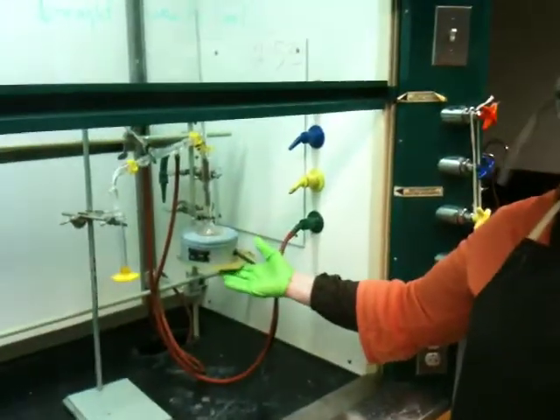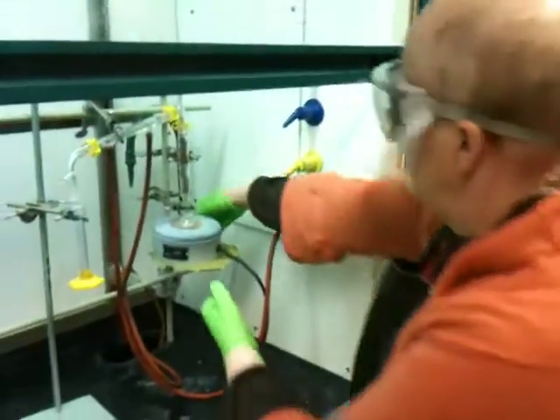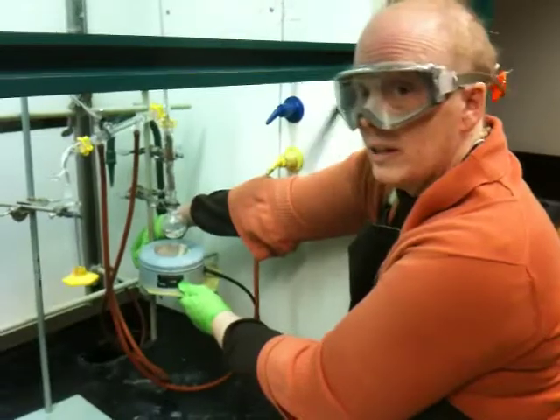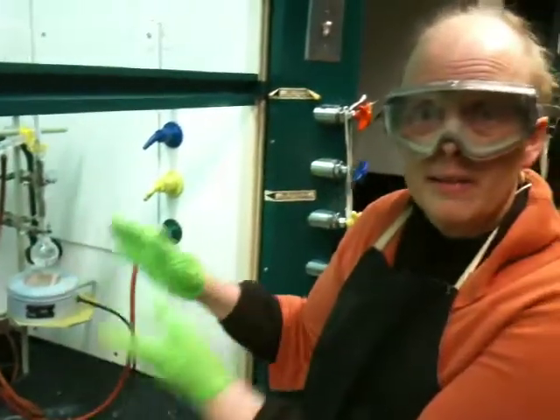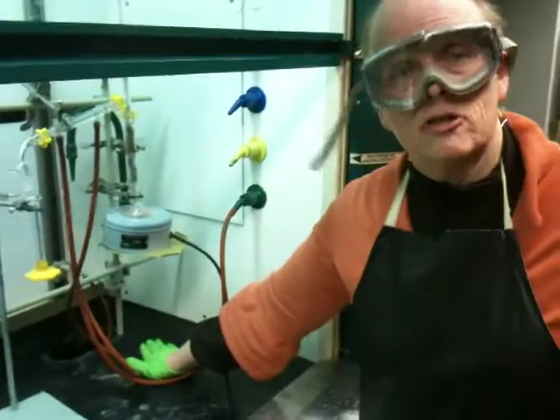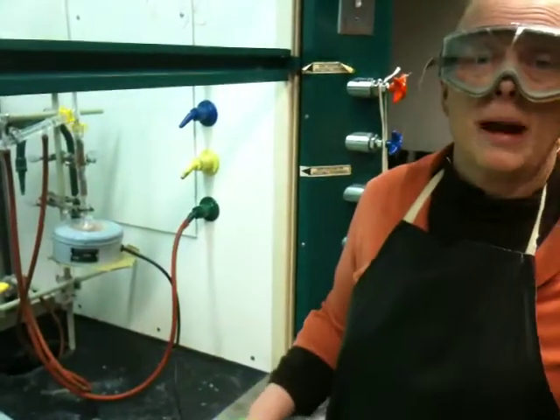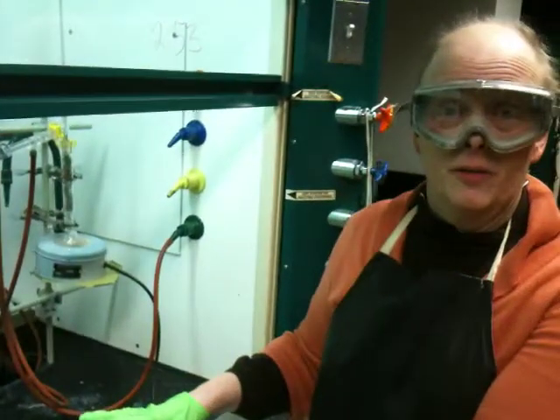Why do we build these apparatuses up high? We do it so that if you had an emergency, you could quickly lower this and stop heating the liquid. That's a really good thing to be able to do. Because this is a concave heater, if you built it on the bench, you would not be able to remove the heater rapidly. So when you have a problem — whether it's boiling over, bumping, fire, explosion, or potential explosion — you want to be able to get that heater off quickly.